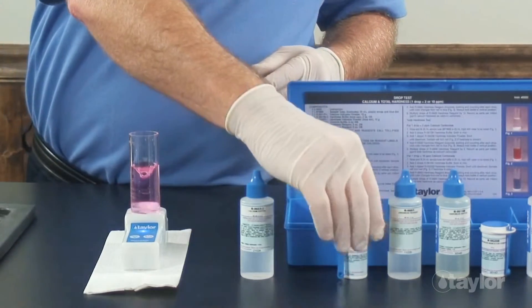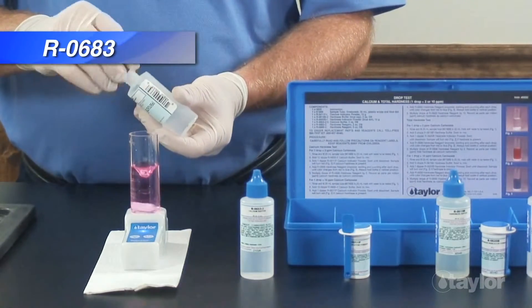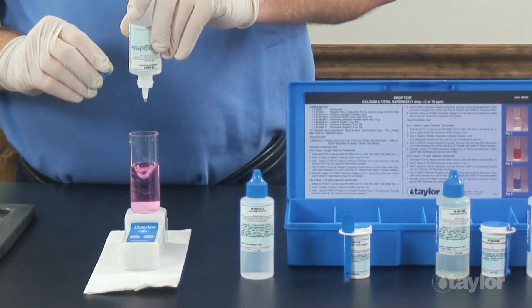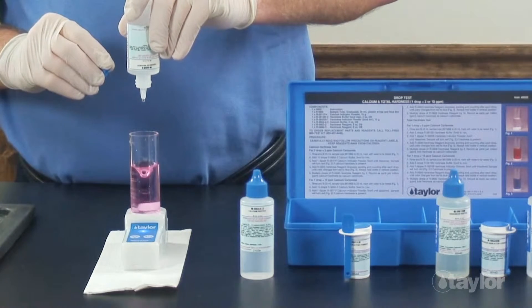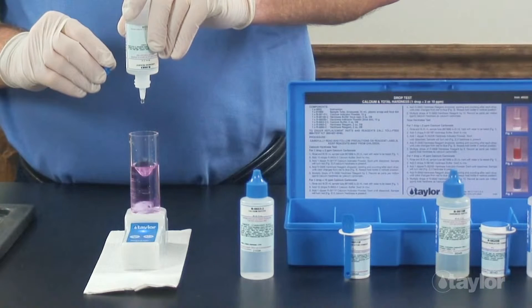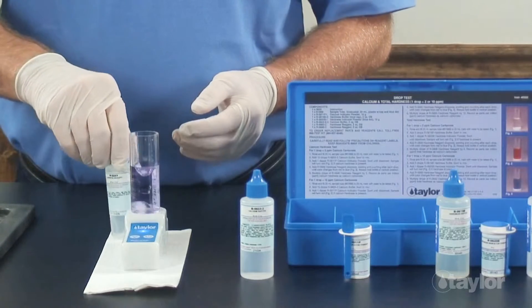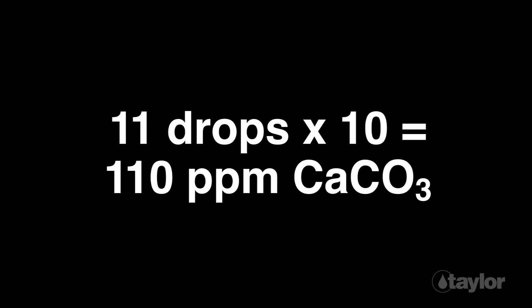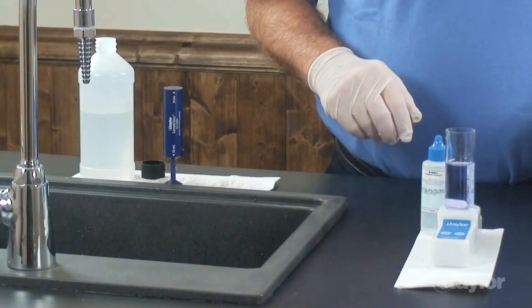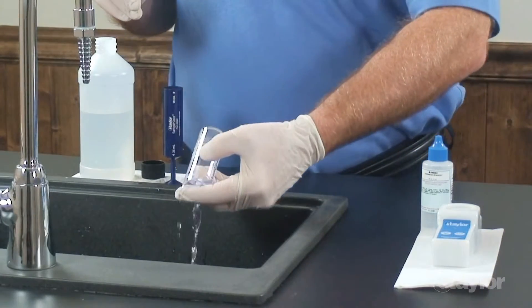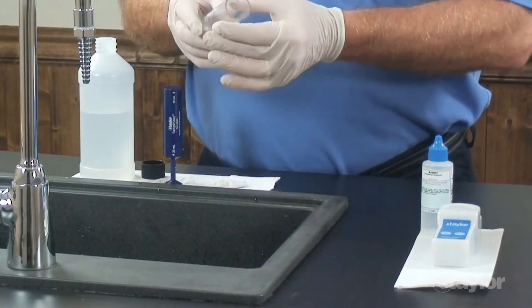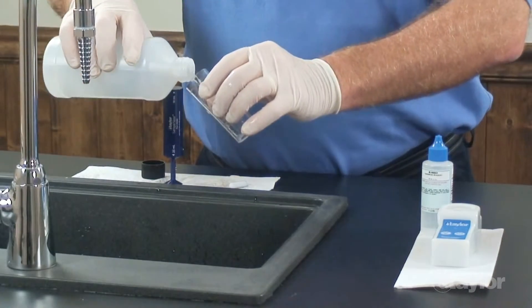Next, add hardness reagent drop wise, swirling and counting after each drop, until the color changes from red to blue. Multiply the drops of hardness reagent needed to reach the endpoint by 10 and record as parts per million calcium hardness as calcium carbonate. Discard the sample and rinse the sample tube with DI water or hardness-free water before performing the test for total hardness.